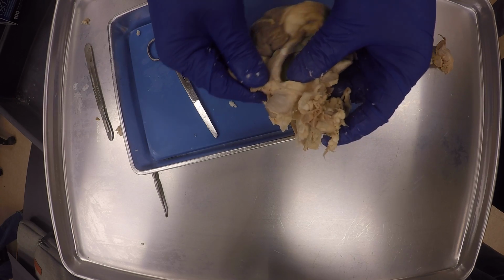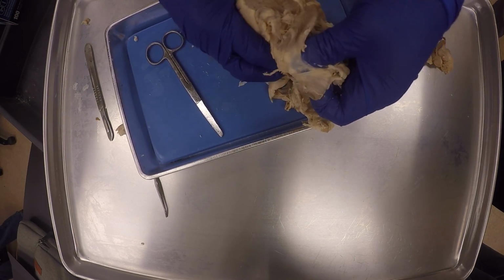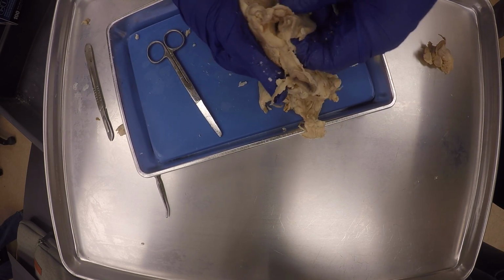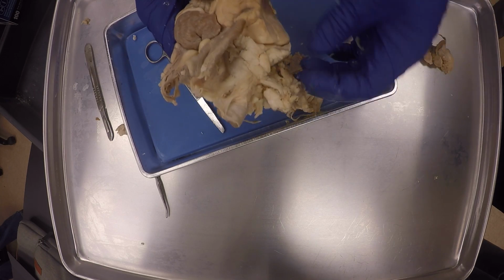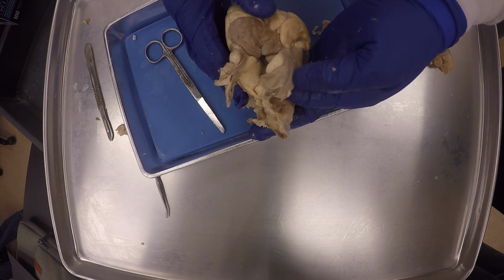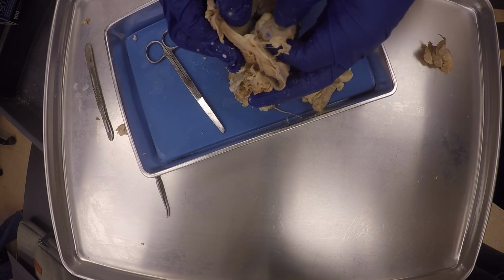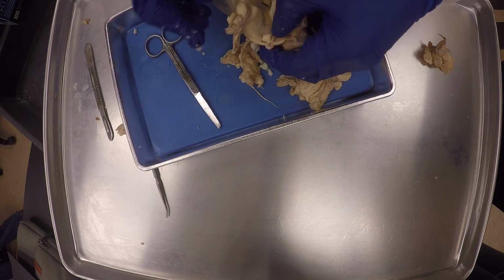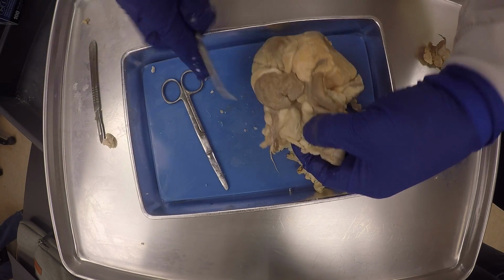So this will probably be the aorta, and this one will probably... I'm sorry. You see how this splits into the left and right pulmonary arteries? Ouchie, and look, I tore it off because I'm trying to be fast, and that is no bueno.